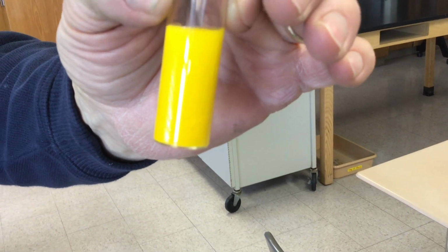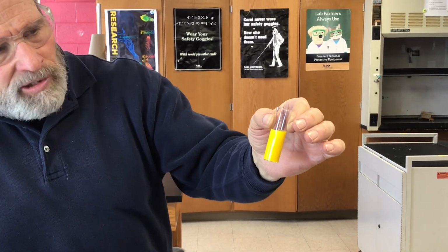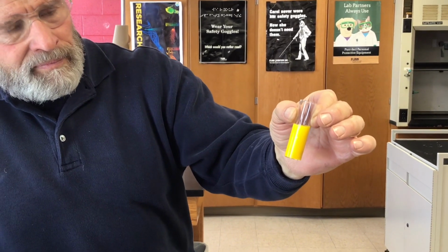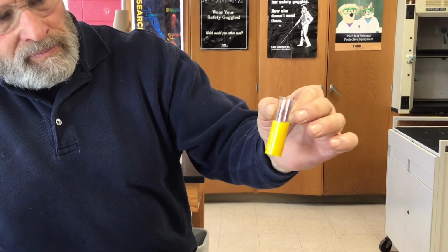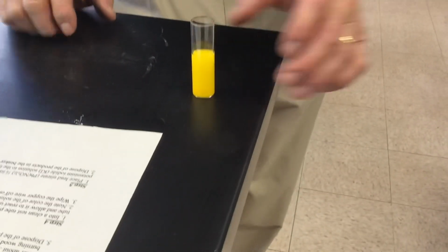So we're forming something there called a precipitate. You mix two aqueous solutions and a solid forms. That's precipitation. Set it down. I don't know if it sits steady if I'm not shaking it.